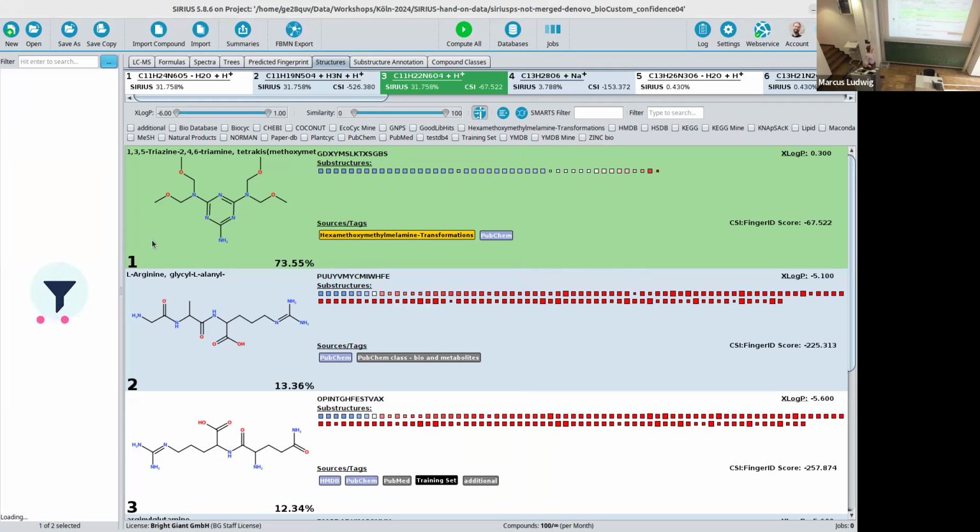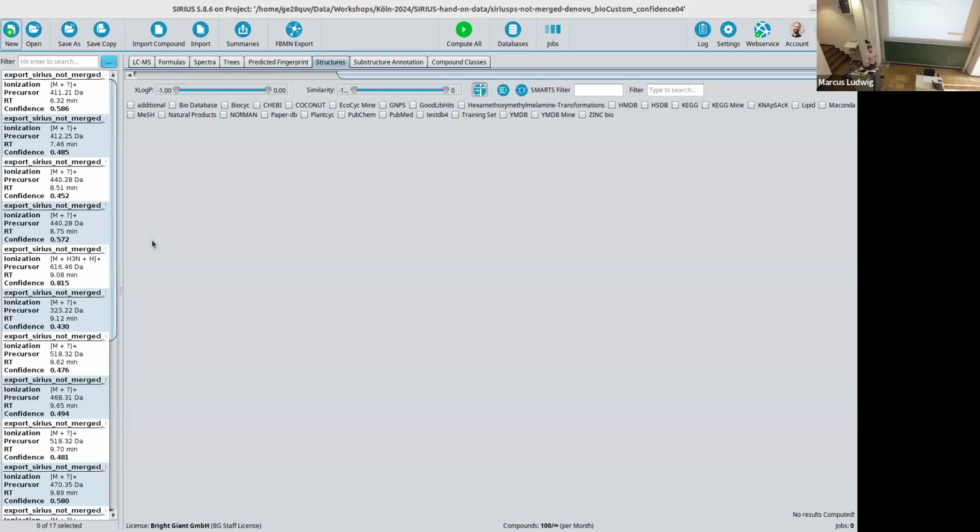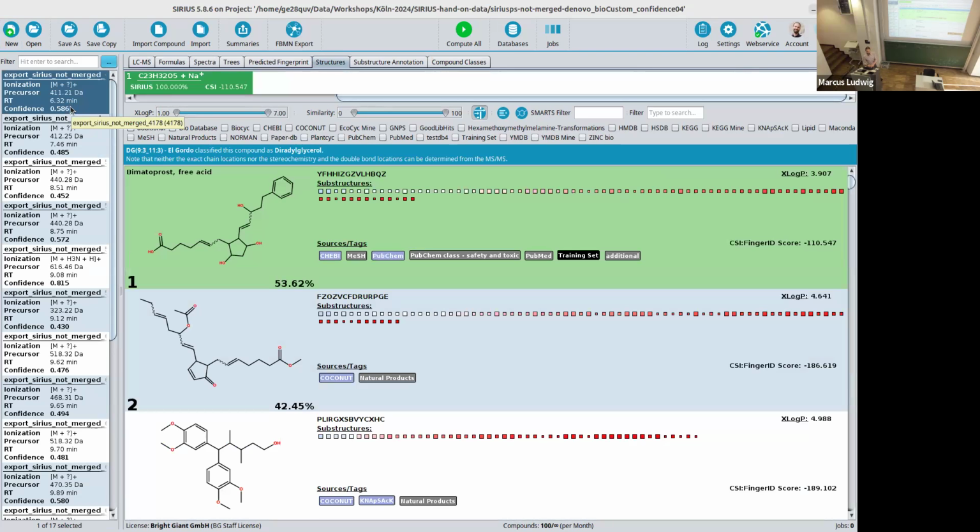And then I can show you an example where it annotated. If you have very big structures, if you assume that it's in the database, we can find it, but if it's too repetitive, it may not be the best tool to do so.